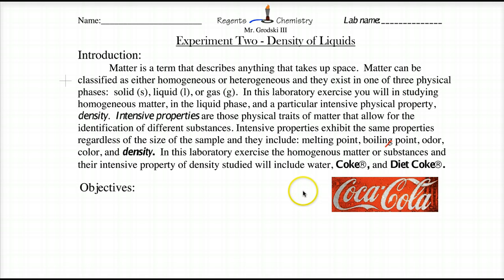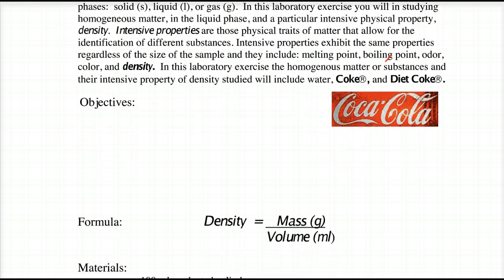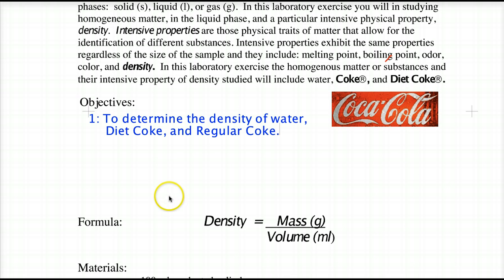This is the instruction and introduction to Experiment or Lab 2, Density of Liquids. For those that don't have the objectives, I'm just going to review them pretty quickly. Number 1, determine the density of water, Diet Coke, and regular Coke.